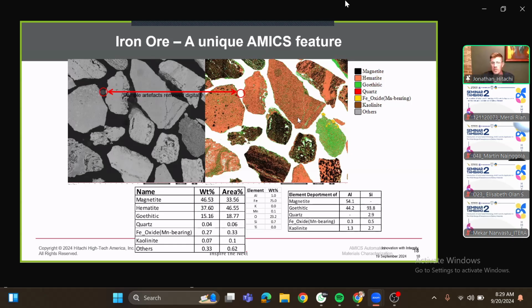So this used to be a very manual process where you had to look through a microscope and you had to have a geologist that was trained for years. But now we can program the scanning electron microscope with that, and a single geologist can have a much higher throughput of samples because it automatically collects the data and presents it in terms of numbers.